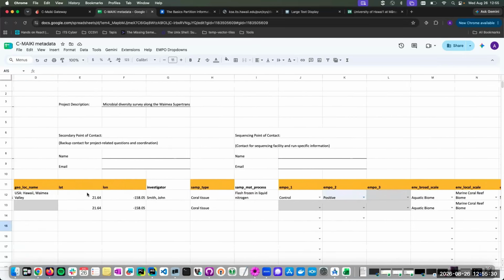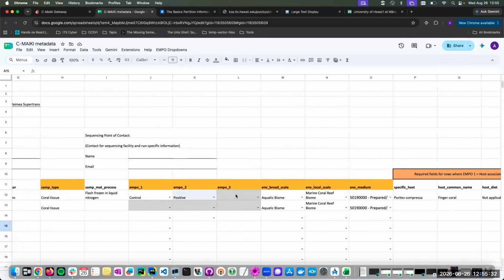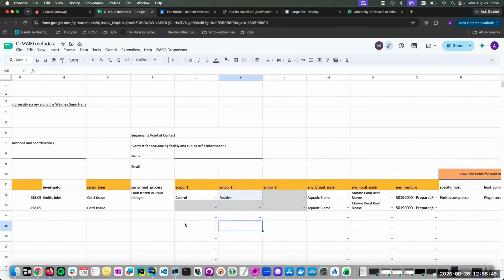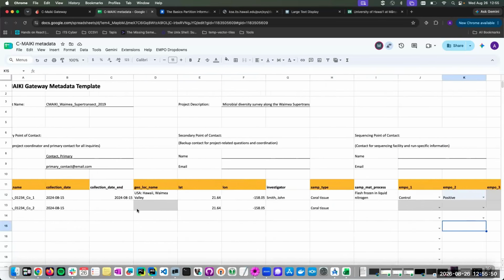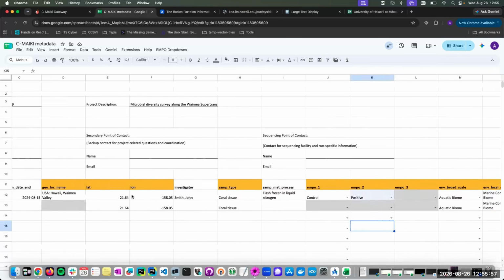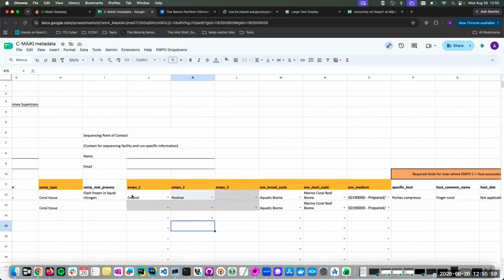Google Sheets can do things like dropdowns. So we have included dropdowns here. We can even do conditional dropdowns. So depending on what you chose in your prior field, if it's contingent upon that, it will render whatever options are there, but it will not validate. It will not ensure your fields are correct. Some of them I've tried to include some very basics, like if you have collection date and you add, I don't know, letters, something like that. That's a no-go. Some very basic inline validation.